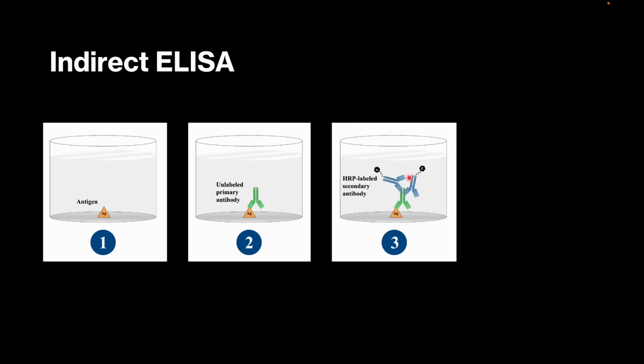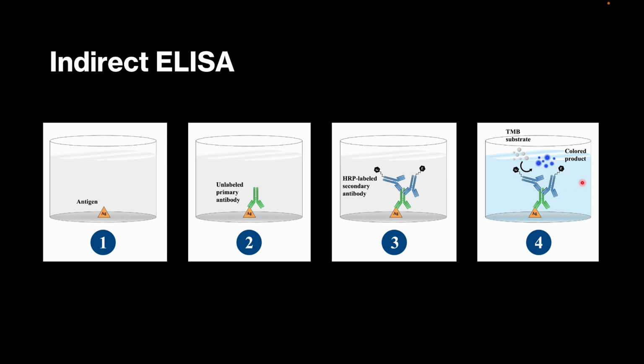And then we put the secondary antibody, which is not very specific. And if you can see in this, if there was no secondary antibody, only the primary antibody is linked with the enzyme, you will see only one enzyme here. But now the signal is amplified. As you can see, two or three antibodies can bind here, and when we put the substrate, we get a lot of color from here, from here. So it's not that expensive, and you get the signal amplified.